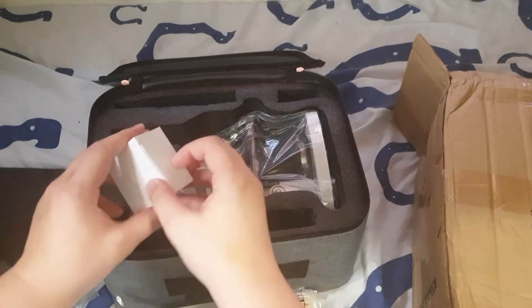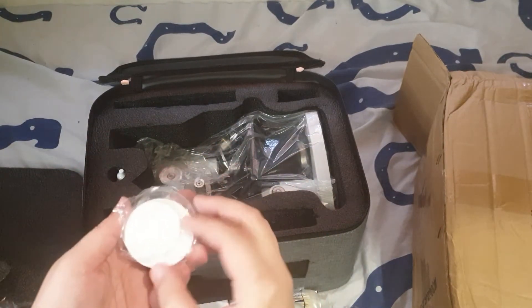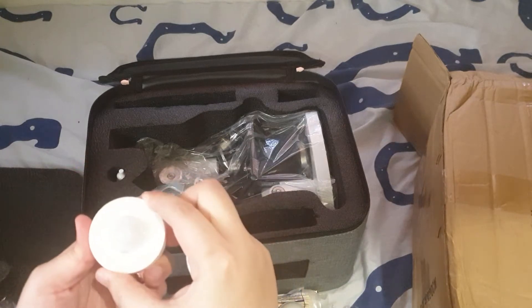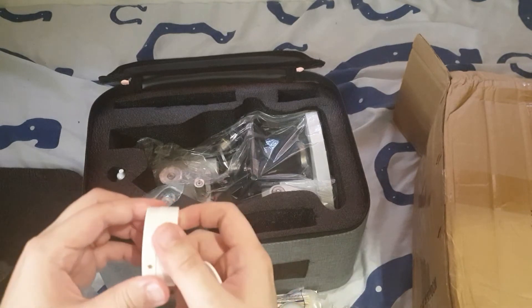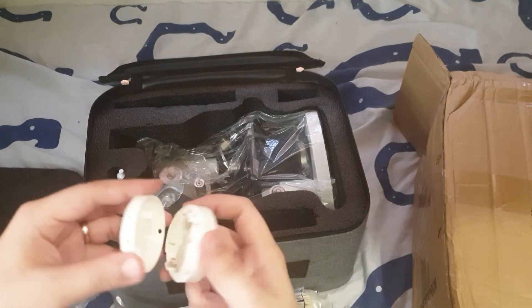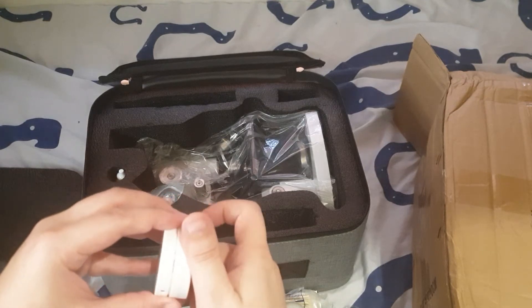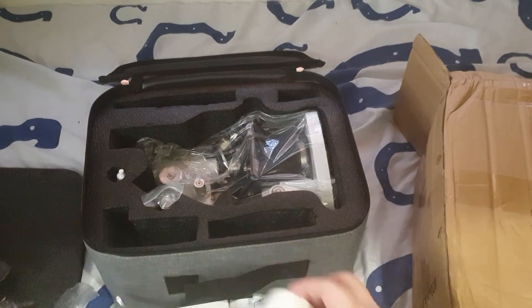There you go, there's another one. This is another lamp — this one goes over the mirror. It's got some sticky tape there. No batteries — yeah, it doesn't have batteries. Triple-A. So this one goes over the mirror, and instead of using natural light, you can use an LED light.